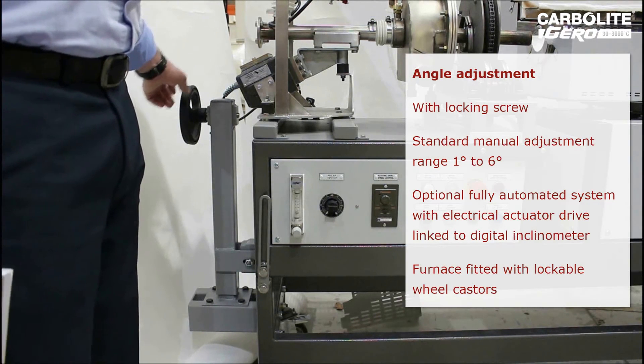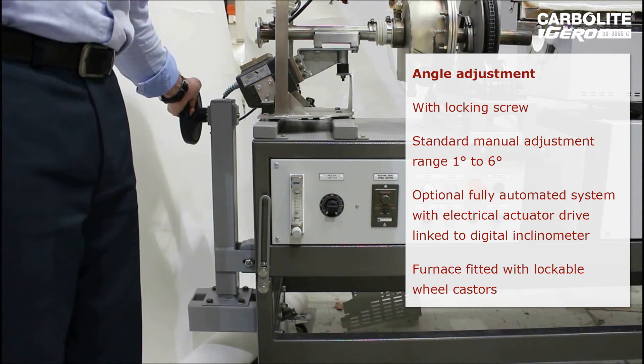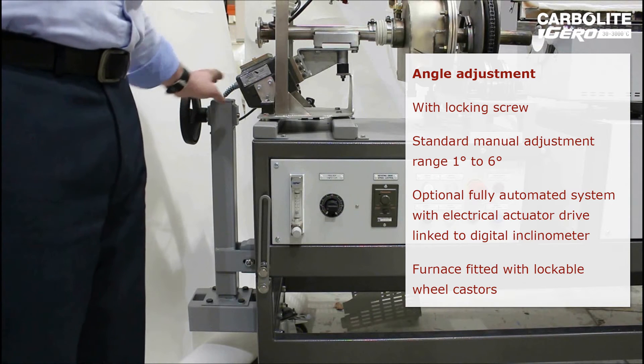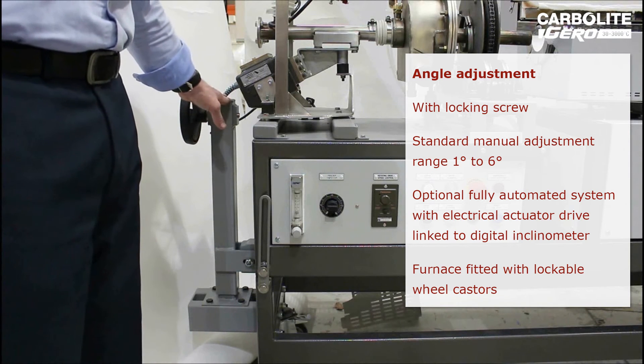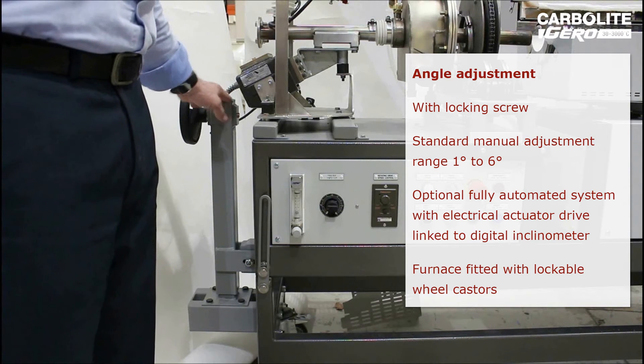Control of the inclination is mechanical via this screw jack system. This is a standard option, but it can be replaced with an electrical actuator which can also be linked to the control system.